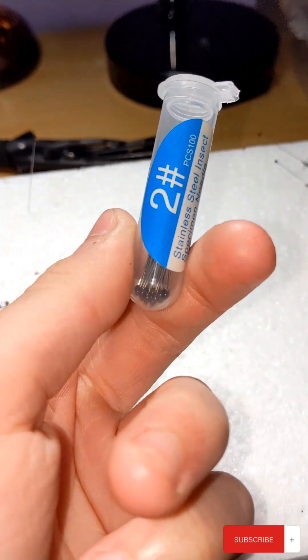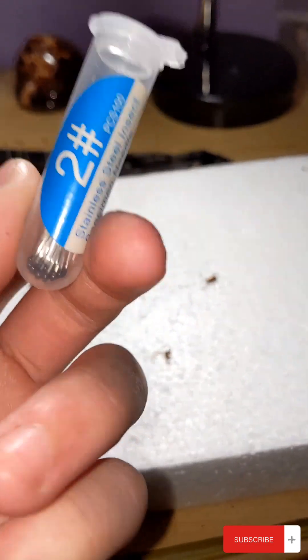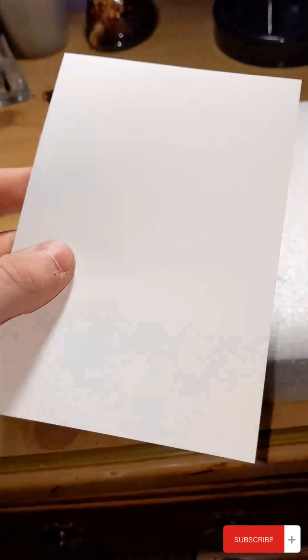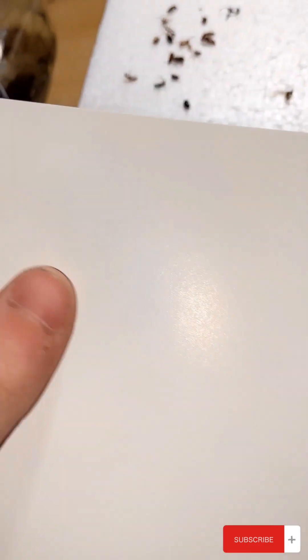You'll need a number two or number three pin. It'll easily go through the paper. So photo paper or card stock will work for your paper. I have a little piece of photo paper here. If you don't want to use the shiny side, I just use the more matte side.